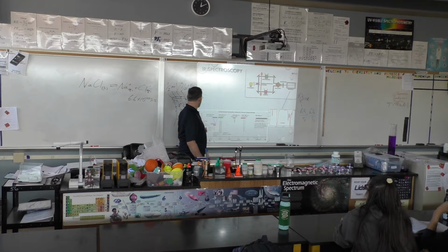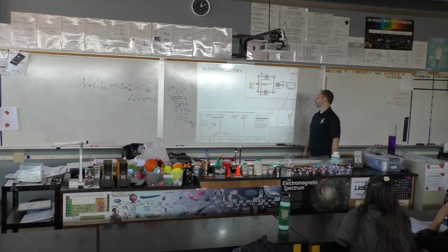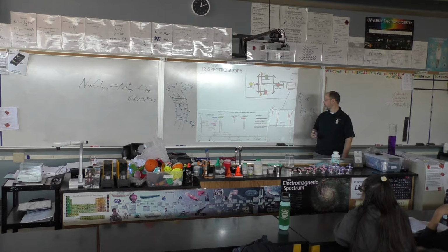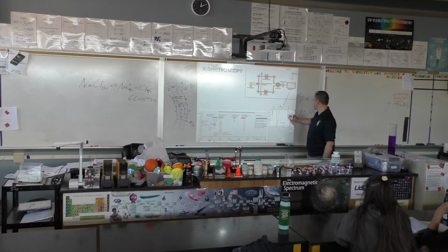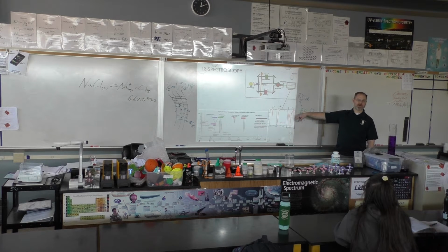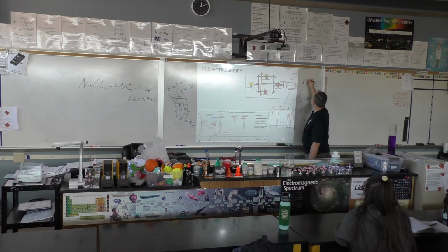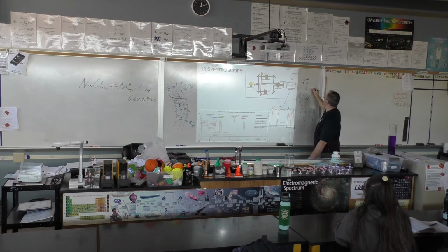And then basically what you see, where you see these peaks, is what bonds are actually absorbing. So you're like, all right, so I got this peak at like 3,500. Oh, this must be the OH. There must be an OH present. And something around 3,000, okay, that's a CH present. And then this is called the ignore it, we don't care about the range. It's basically the junky range, everything absorbs it. So you're like, I need a molecule that has OH bonds and that has CH bonds. The molecule turns out to be ethanol.